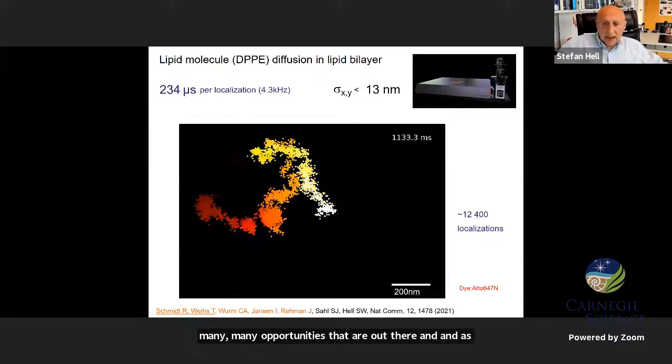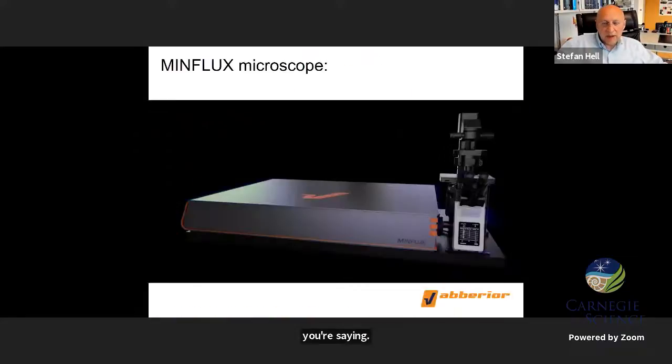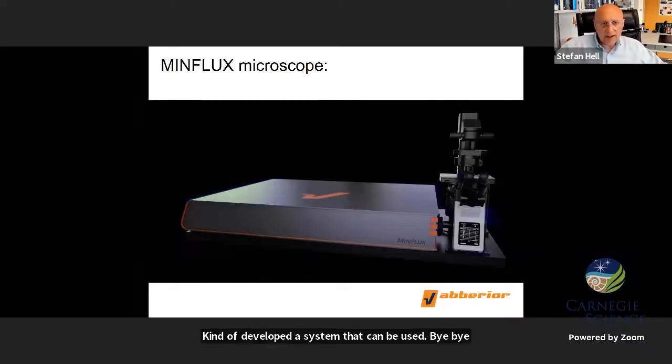As you're saying, in order to disseminate the technology and to make it available to the greater life science community, I've set up a company with my former students, and they have now developed a system that can be used by biologists.